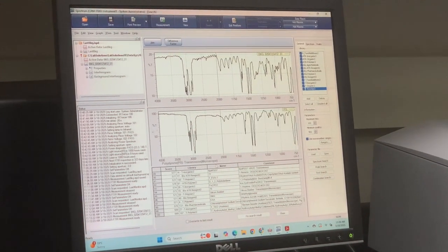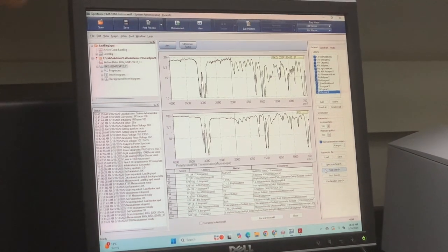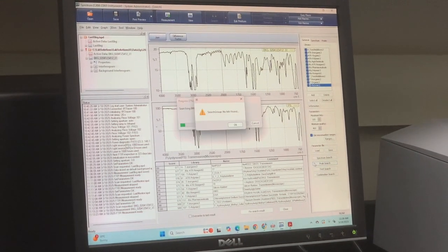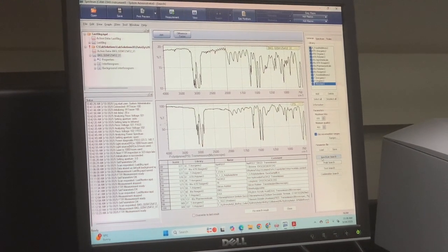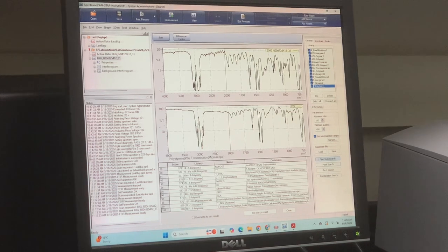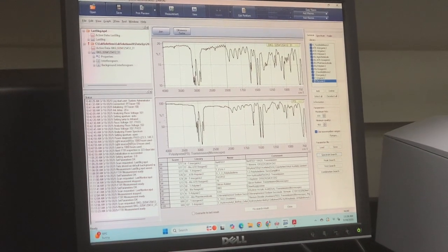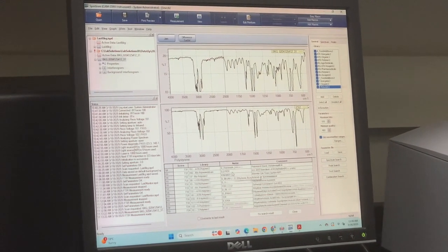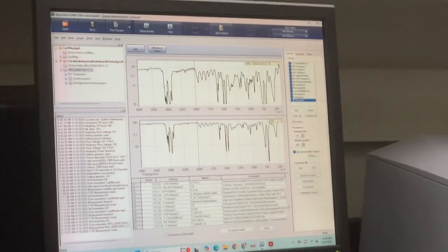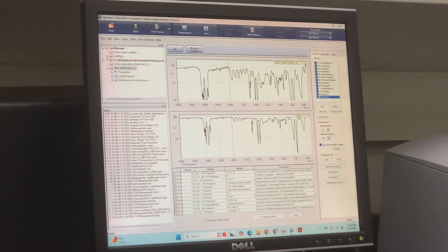So now let's run spectrum search. Running for labels. Let's go with some data. It could be that if you do the range, it's only matching that portion of it.